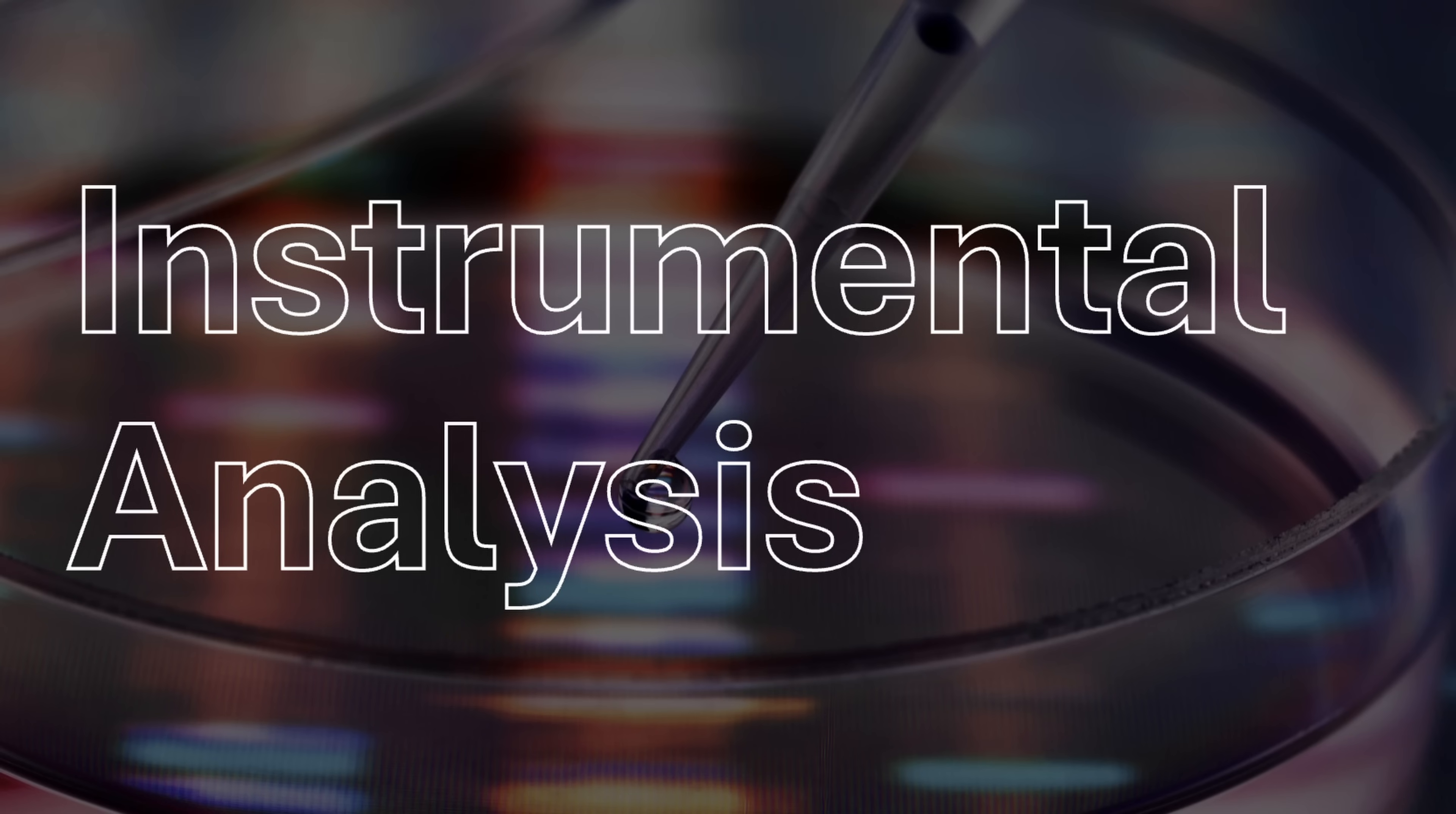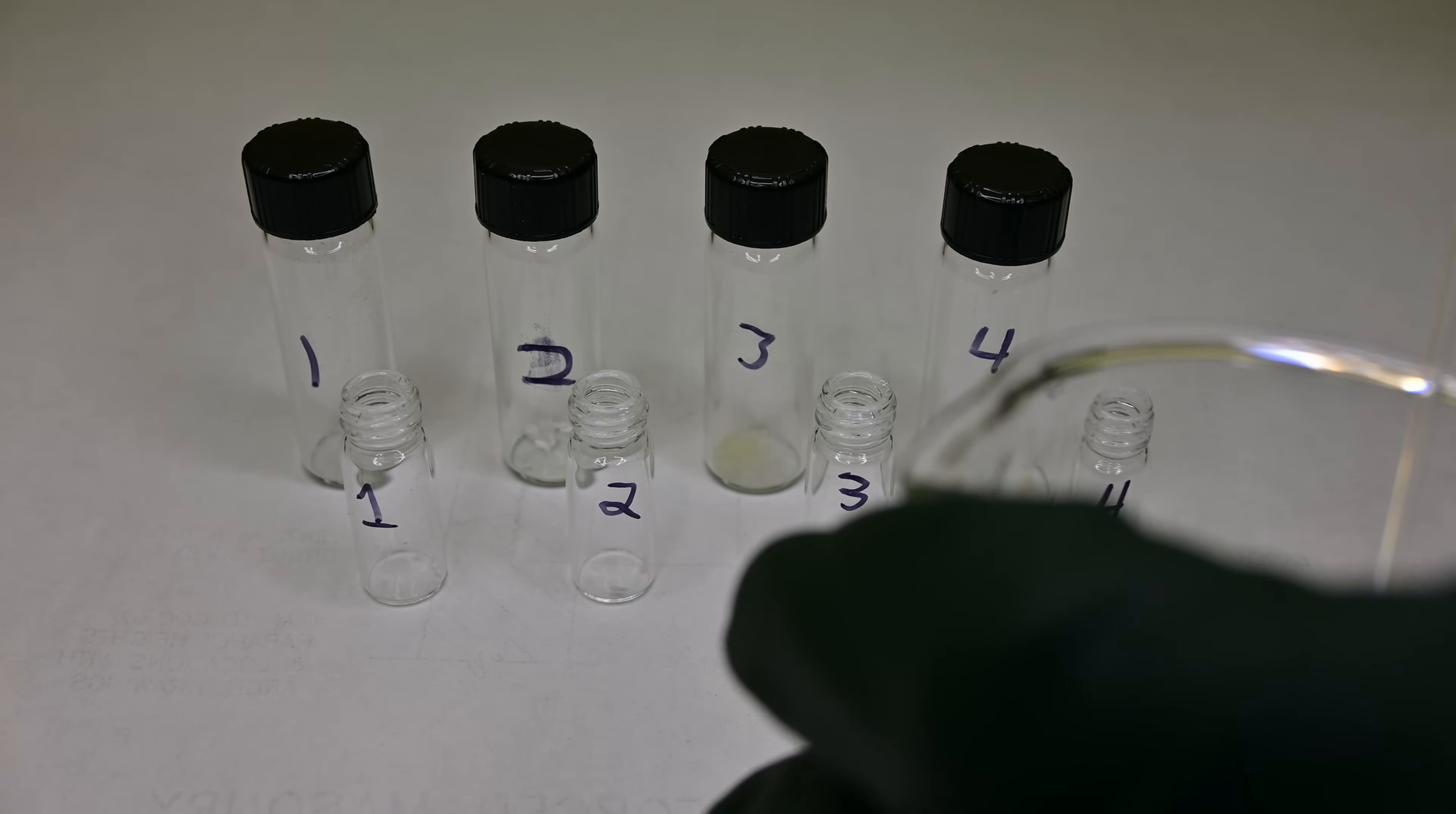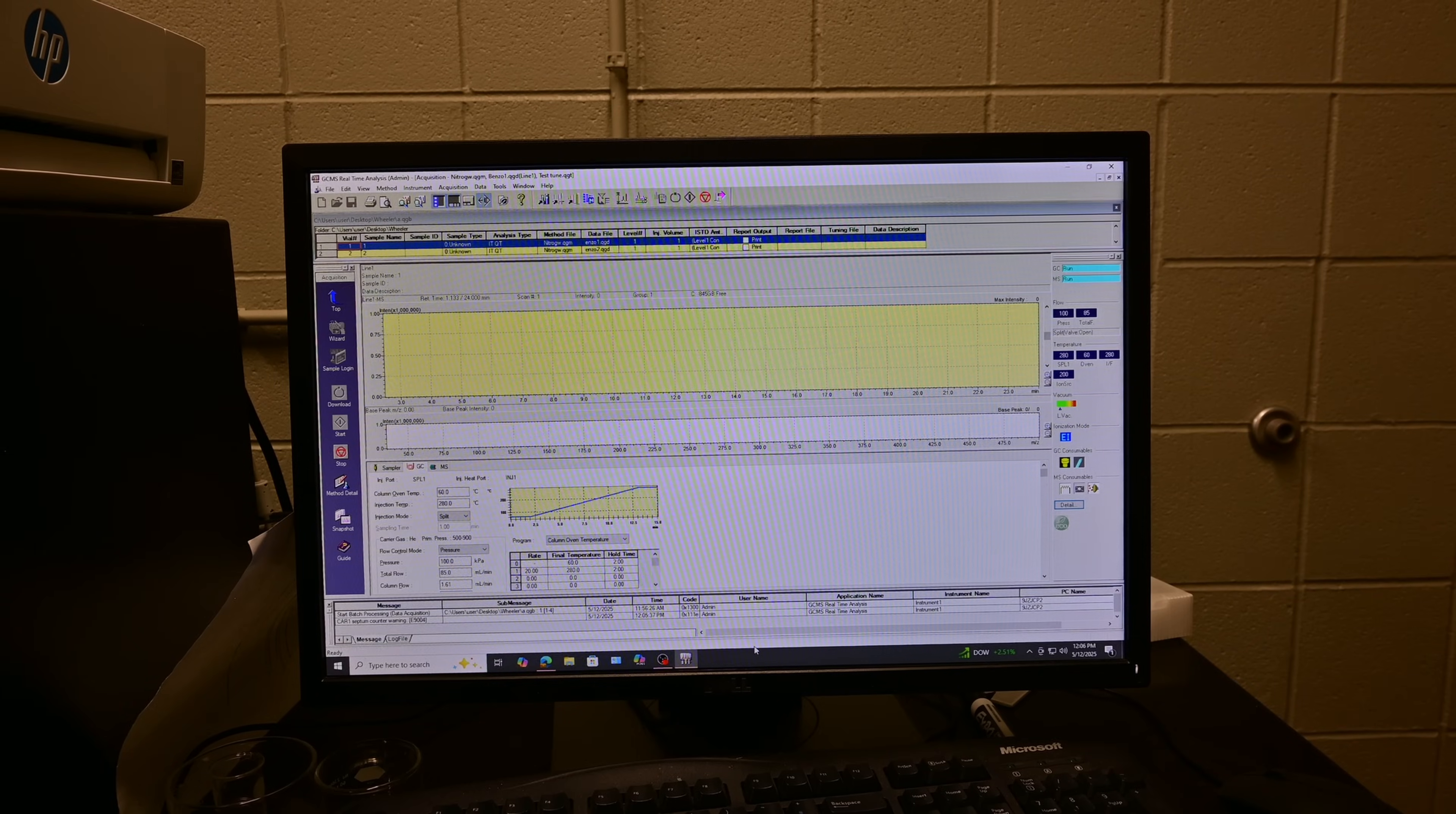Now for my favorite part. Confirming that I've actually synthesized what I'm claiming to synthesize. Instrumental analysis. I save small samples from each of the syntheses for this purpose. Now we're going to run GCMS to verify their identity. I transfer small amounts of each material into a GCMS vial. Then I add dichloromethane to the vials. These vials were then loaded into the auto sampler and ran. Each sample takes around 16 minutes to run, so through the power of editing I jump ahead to when all the samples are done.